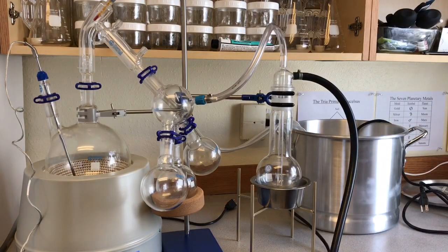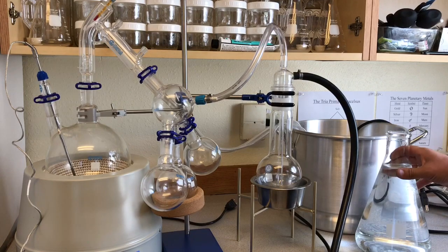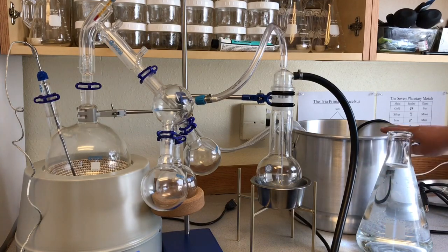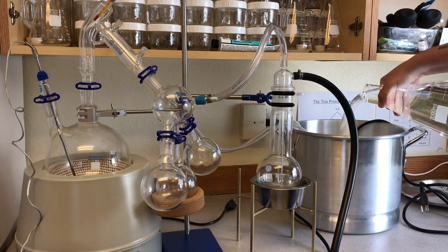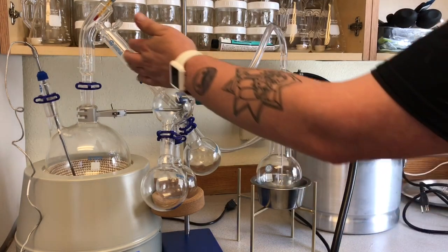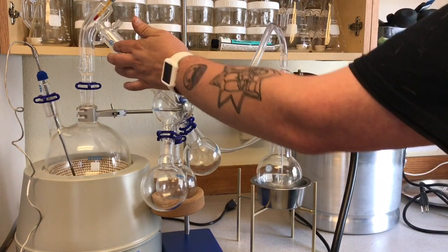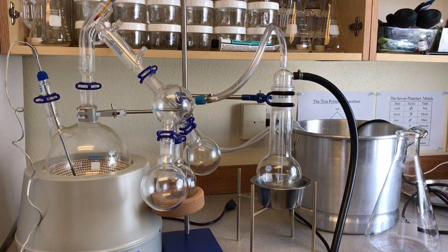So there's about 7 pounds of ice, and if I need some more ice throughout the procedure, I can add some more. Now I'll begin adding some water. This is a 2-liter Erlenmeyer flask, and we don't need filtered water or anything like that. Just regular water will be great. The water is not actually going to be touching our material. The water is simply going to be to cool this area. And I'll probably add between 4 and 6 liters of water into my stainless steel bucket here.